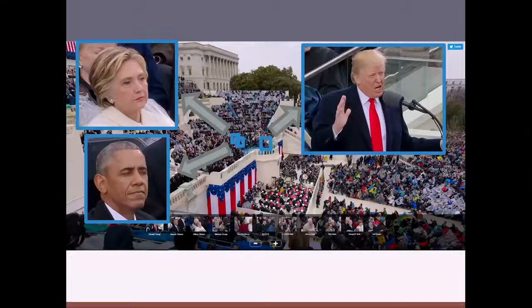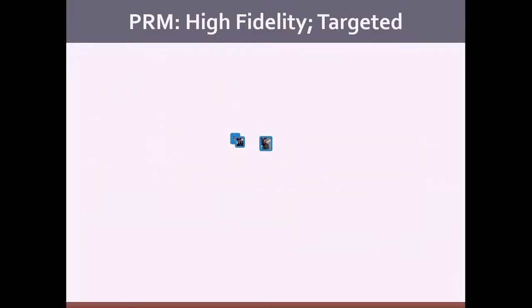You're collecting this really detailed amount of information across an entire image or a broad range, where the equivalent of parallel reaction monitoring or SRM would be like the equivalent of collecting the data just on very specific individuals. So you can have a telephoto lens, get an incredibly high quality image of a sub portion of that total image, but you're missing the bigger picture in many ways. You're looking at it a little bit out of context of everything else.